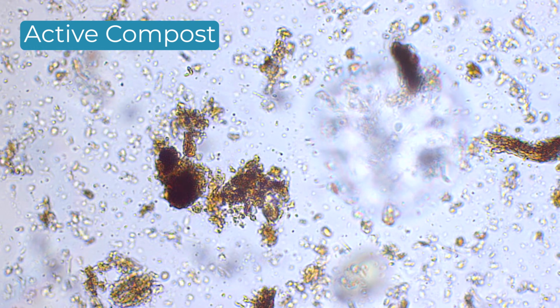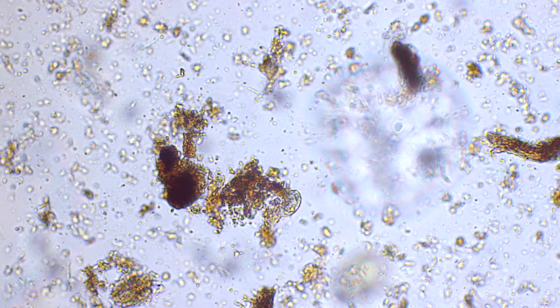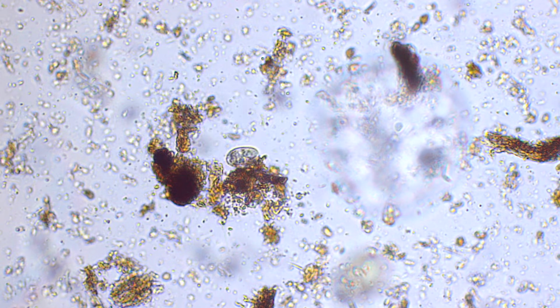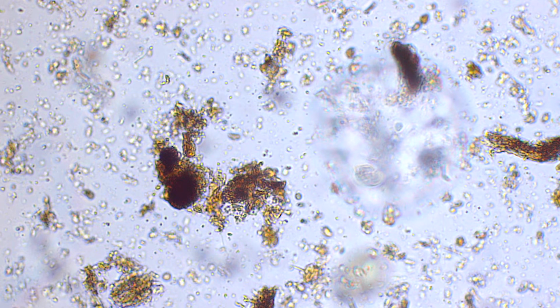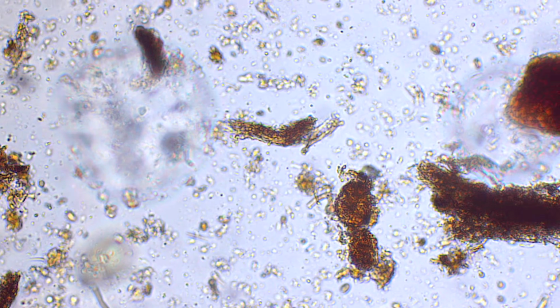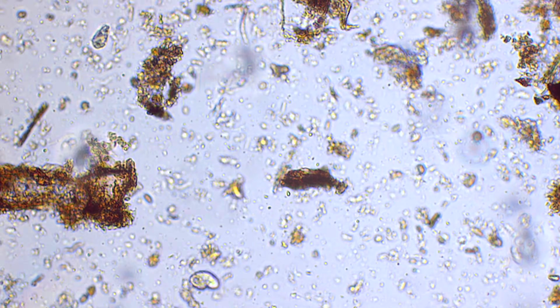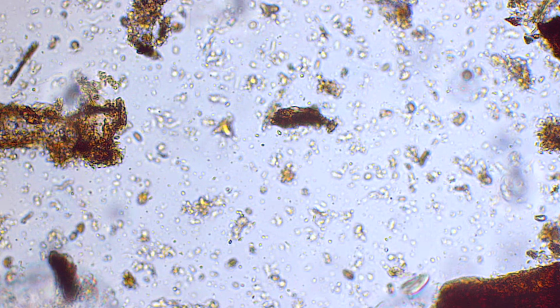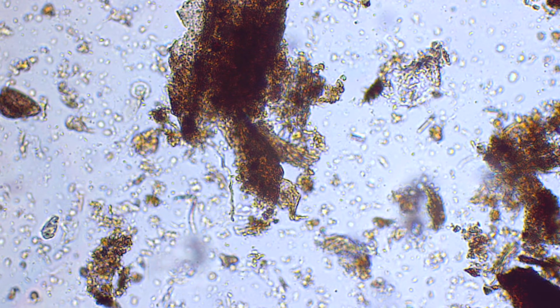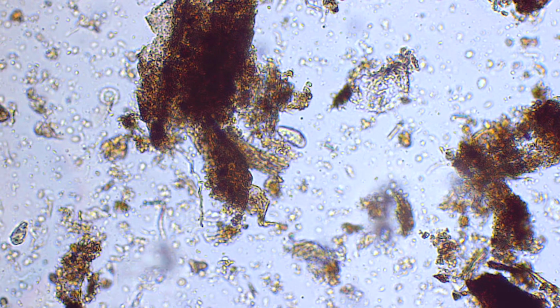Active compost. Active compost is commonly characterized by high levels of bacteria and protozoa. Sometimes they can have a lot of nematodes, and fungi populations are low to moderate. There is greater biodiversity and microbial biomass, characterizing an intermediate maturity ecosystem. This particular sample features a ciliate amidst an abundance of bacteria.